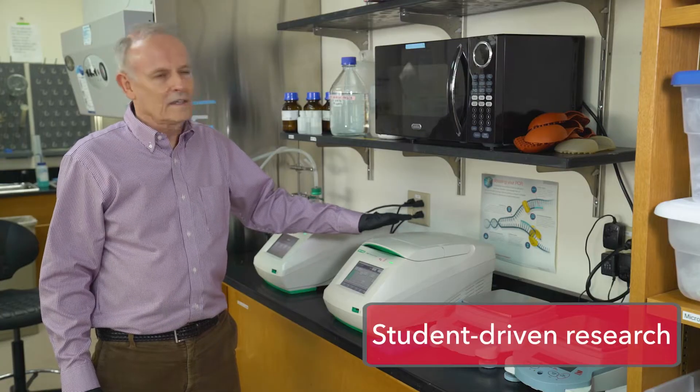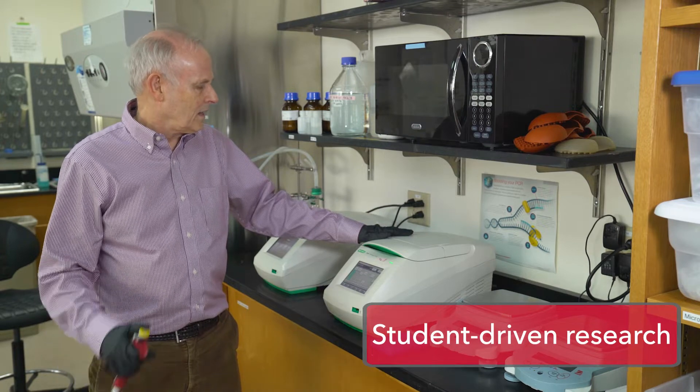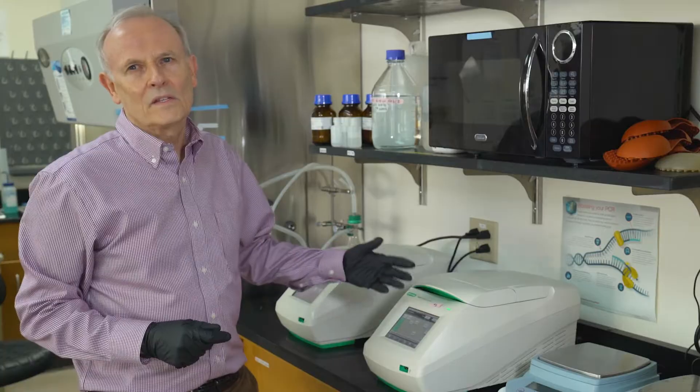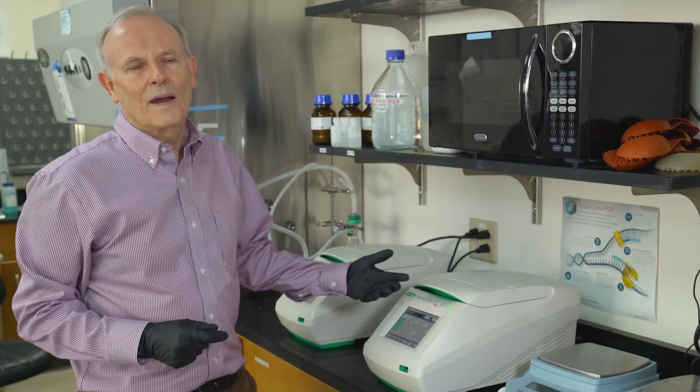What I have here is a thermocycler that we're going to use for PCR, and you can think of this as a photocopier for DNA. We can start with one piece of DNA and end up with a billion within two hours.